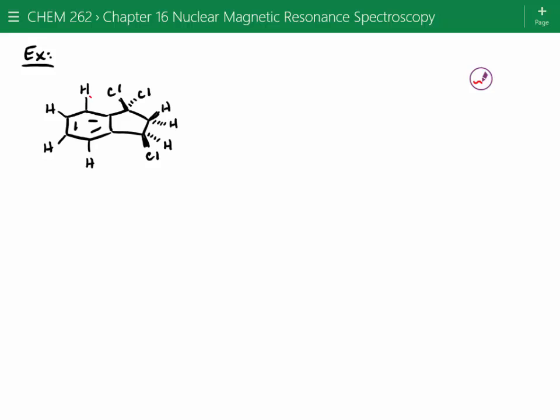All right, so I'm going to label this HA. If it's looking kind of forward and to the right, it runs into 2 chlorines. Are there any other protons in that exact same chemical environment? Yes. What about the one on the bottom? It looks forward and it only sees 1 chlorine. So the one on the bottom is actually different, right?